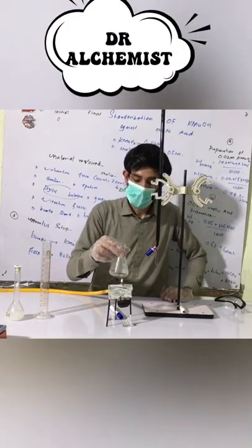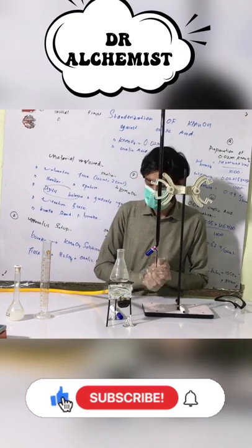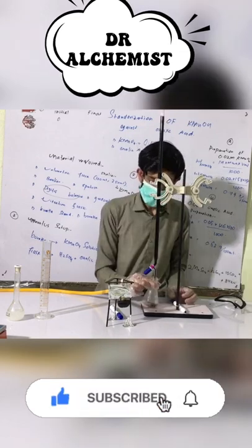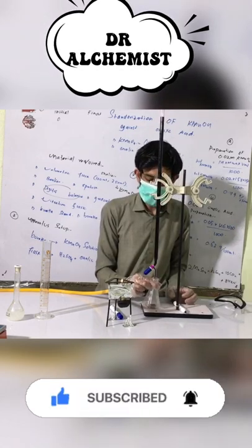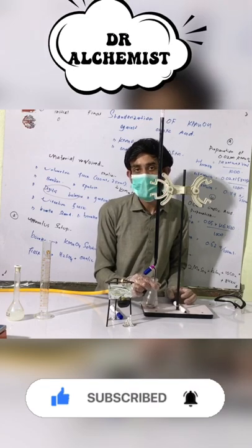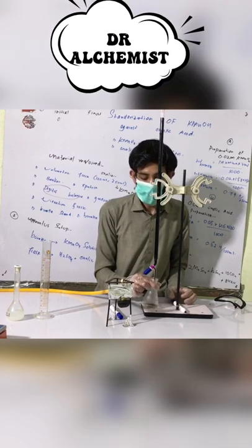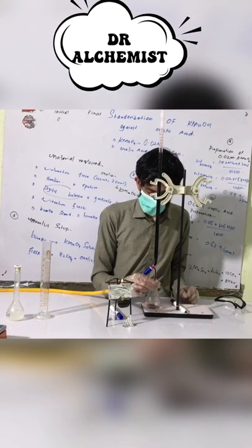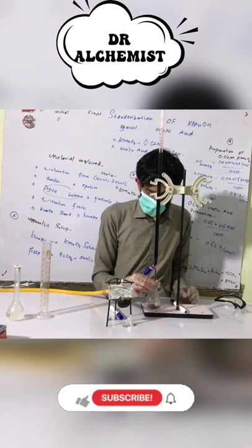After heating for a few seconds, you have to start dropwise addition of potassium permanganate. I am adding potassium permanganate to the titration flask. You will see a color change as the reaction is completed.